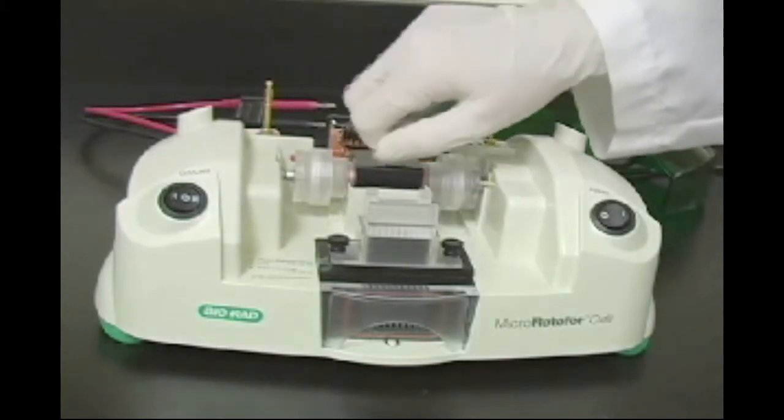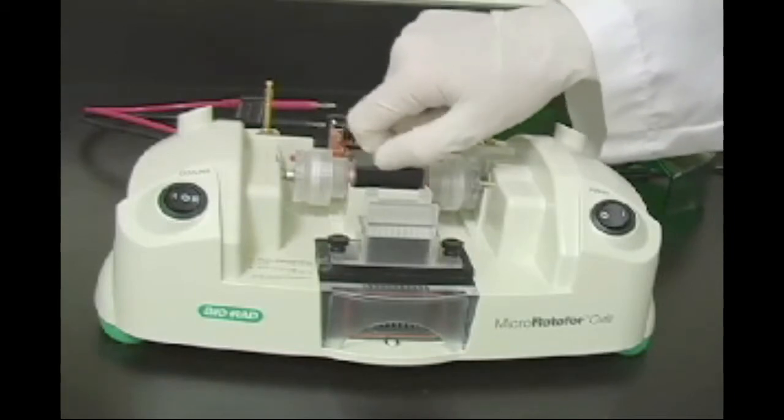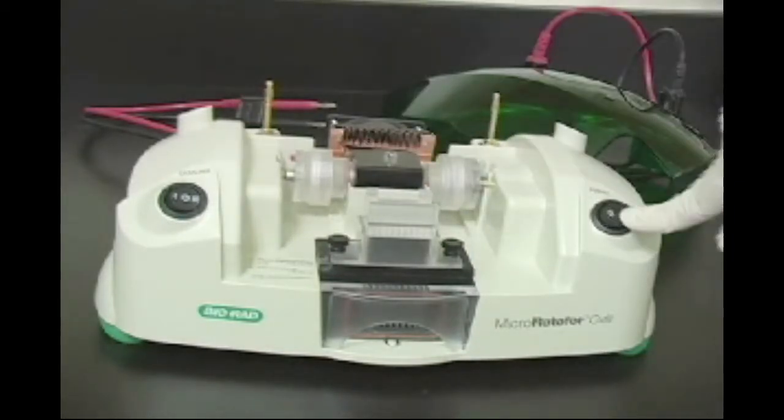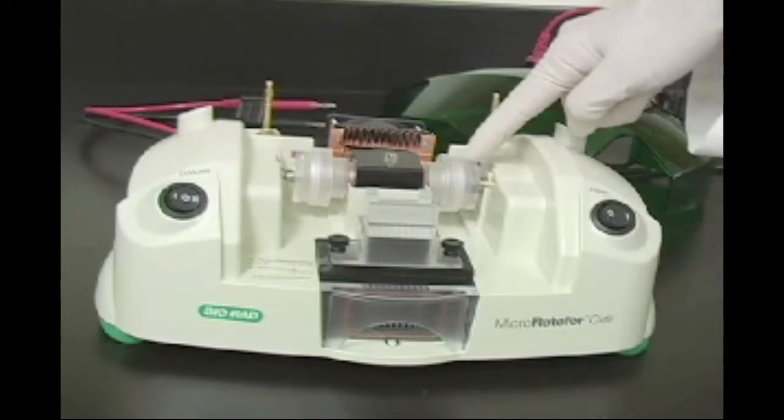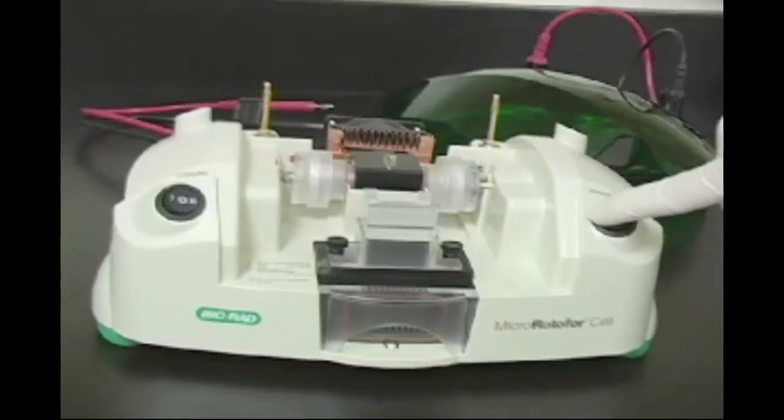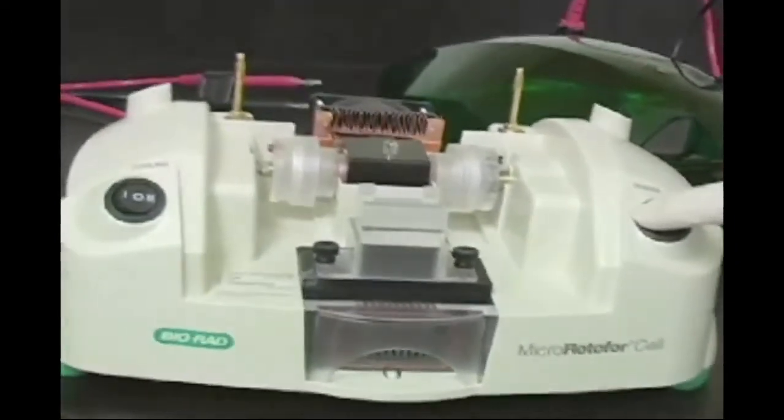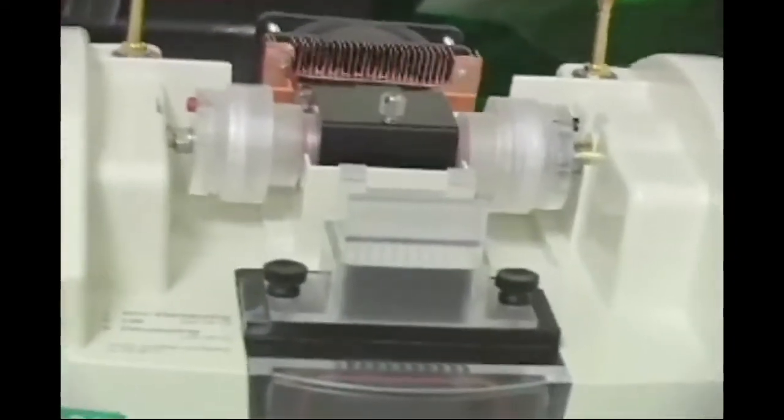Close the cooling block and tighten the screw. Turn the power switch to on and make sure the focusing chamber rotates freely within the cooling block. If it does not, loosen the lid by turning the screw on the cooling block counterclockwise until the focusing chamber can move freely.